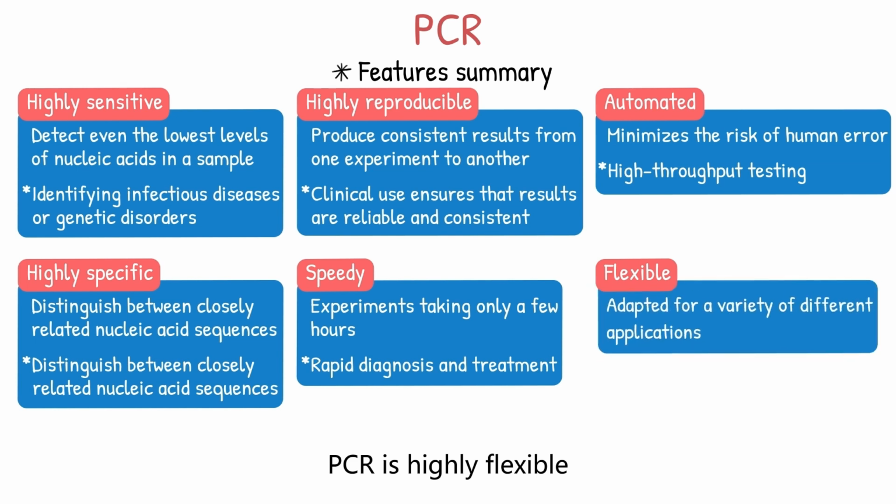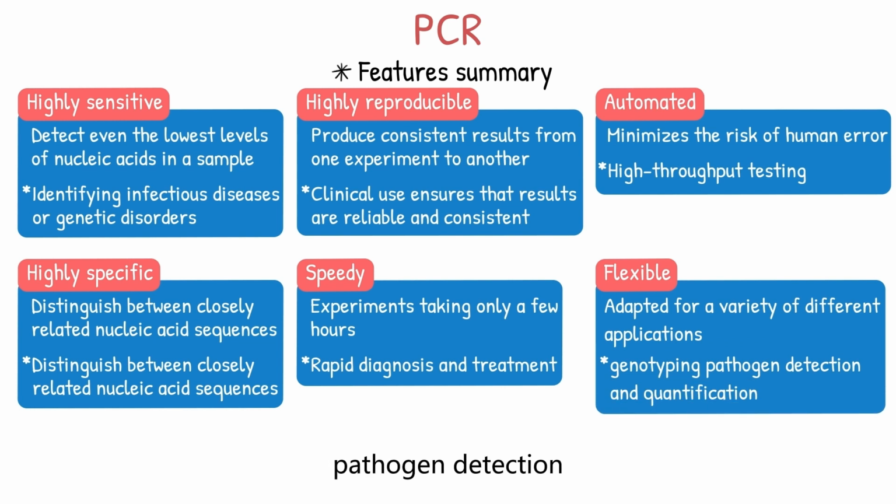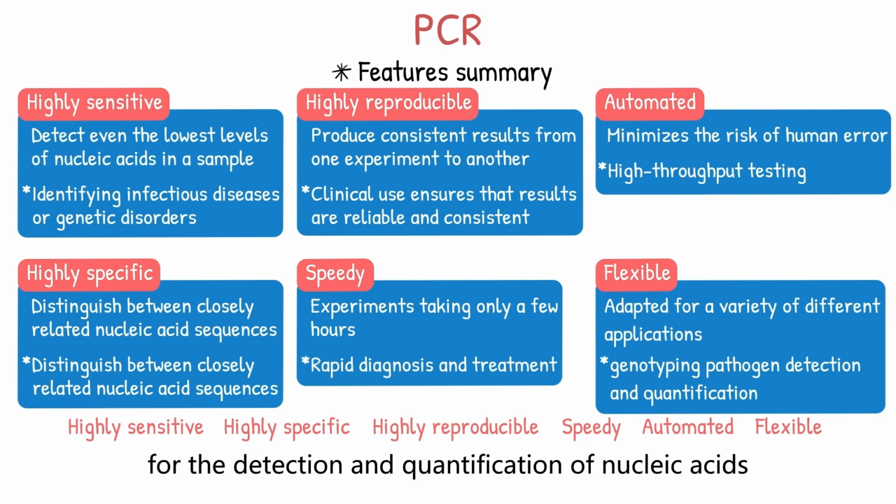Finally, PCR is highly flexible and can be adapted for a variety of different applications, including genotyping, pathogen detection, and quantification. In summary, PCR is a highly sensitive, specific, reproducible, speedy, automated, and flexible technology that is widely used in IVD for the detection and quantification of nucleic acids.